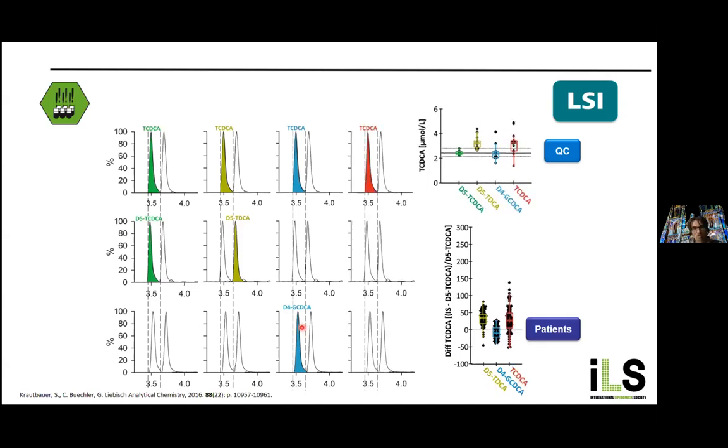And finally, she checked if you just use counts without internal standard, basically. And there you see it's getting wild. You get twofold missed values. So this is clearly an indication that an appropriate internal standard is mandatory if you want to do a precise quantification. So if you have the chance to get a labeled internal standard, you should invest that money.